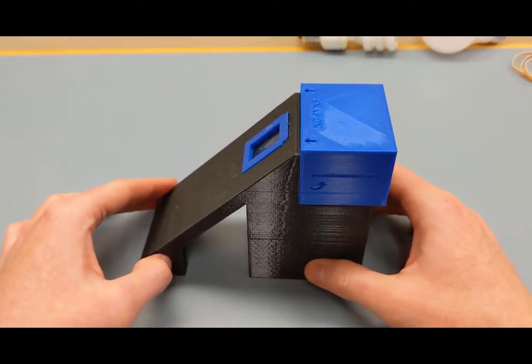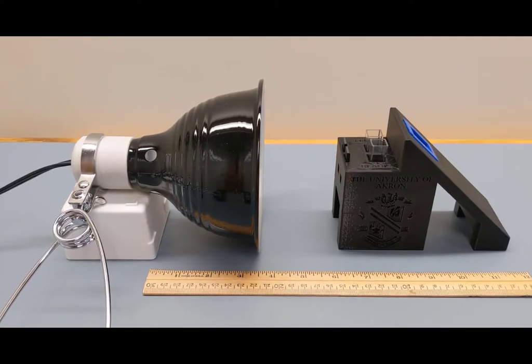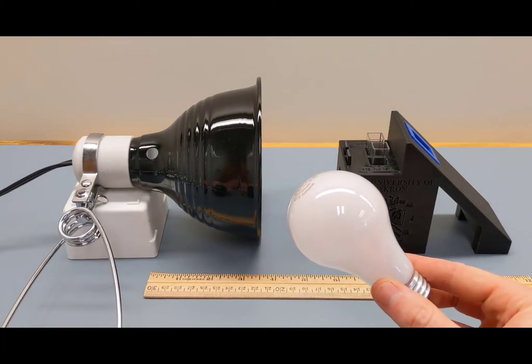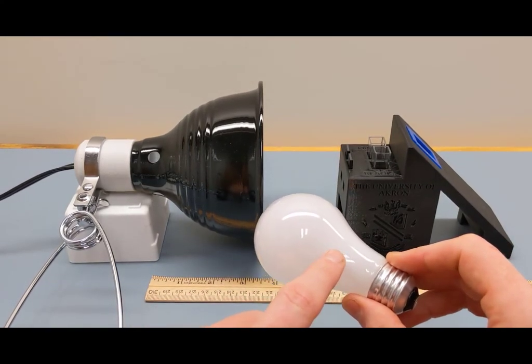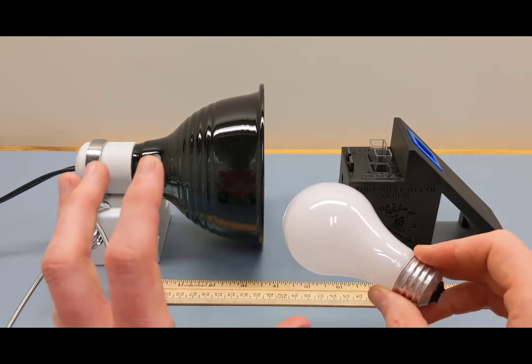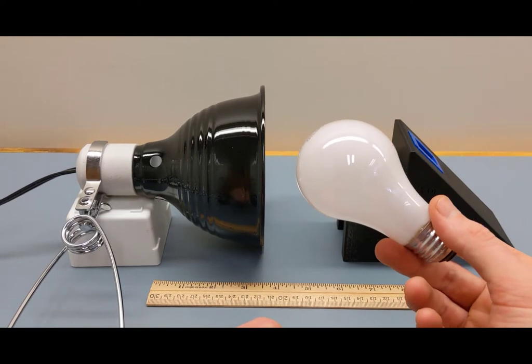Now we just need a light source and the camera sensor. You're equipped with two different light sources. The main one is this incandescent bulb, which provides white light — also called polychromatic light. Because there's a small tungsten filament inside, when a large enough current passes through it heats up, causing emission of light across many wavelengths over a broad spectrum — our broadband light source.